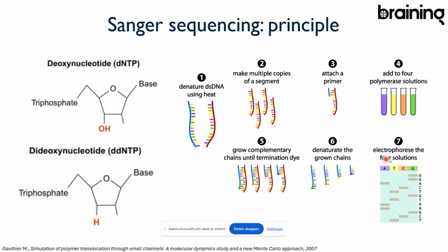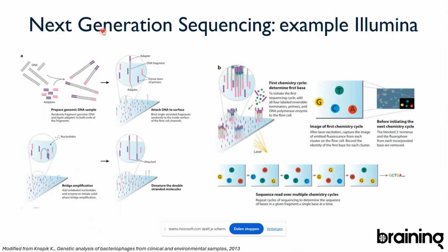And then you have to do your electrophoresis, and it takes time. So you can imagine that if you have to do this for a whole complex genome, this will take ages, right? It's not very efficient. So although this is the original sequencing that has been done for a very, very long time, to use it as a high throughput technique, it's a lot of work. So people worked on a way to bypass the high throughput limitations of Sanger sequencing. And that brings us to next generation sequencing.